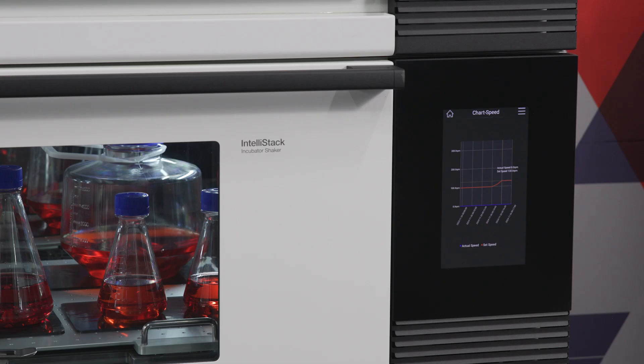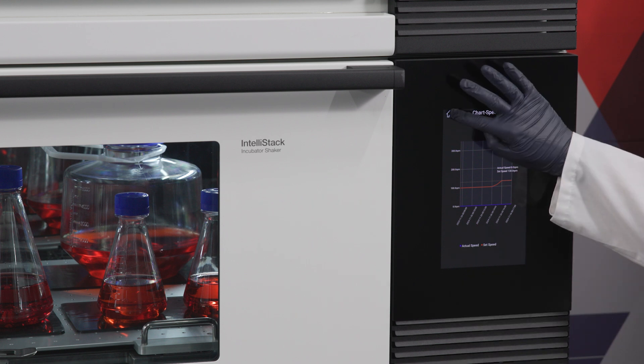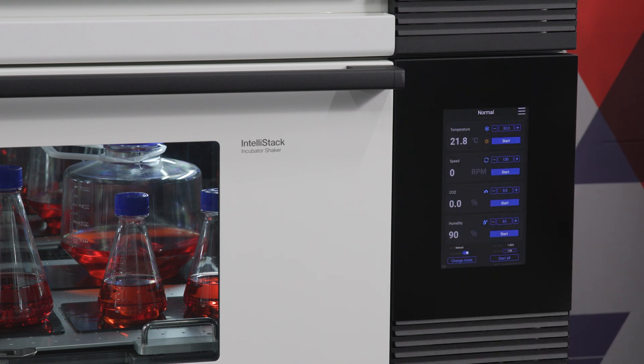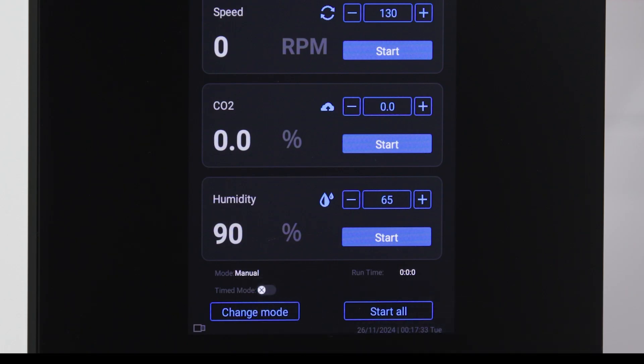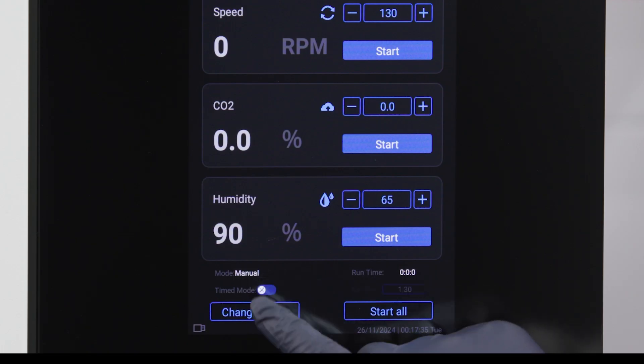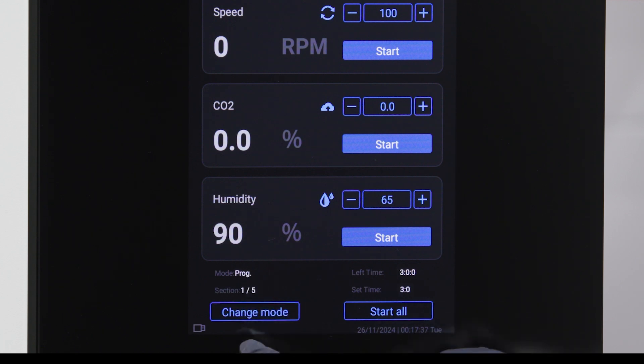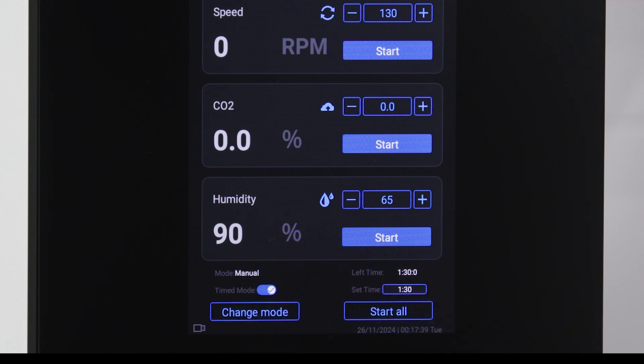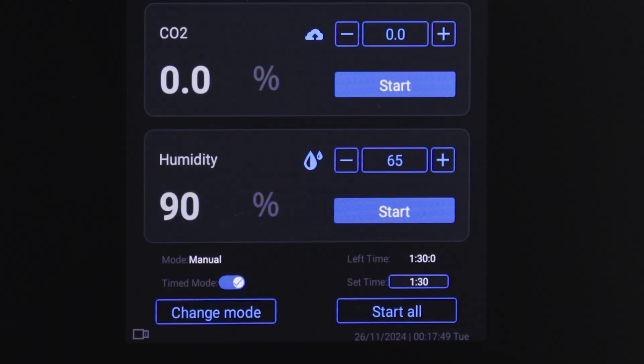The touch program enables you to operate the shaker in manual or program modes. Switch between modes using the change mode button in the bottom left of the main interface. In manual mode, you can operate the shaker in continuous or timed mode.